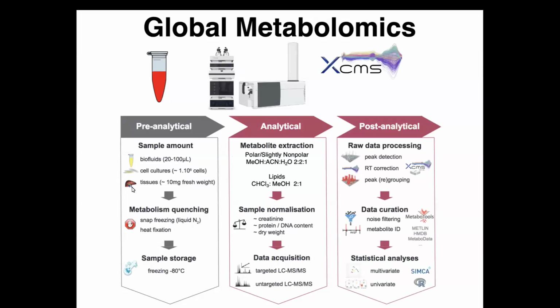After the acquisition is done, the MS data is uploaded to XCMS to run single group, pairwise, or multiple group comparison. XCMS performs peak detection, retention time correction, peak alignment, peak integration, statistics, and annotation. XCMS detects 20,000 to 40,000 features.